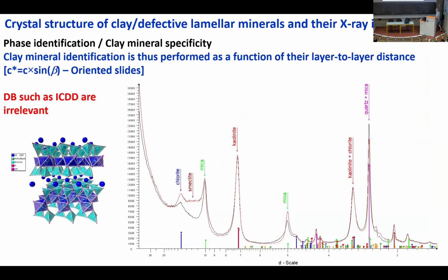We usually do that, so what we are interested in is to measure the thickness of the layers, which means to measure the thickness of these sheets here. And the easiest way is to have them settling like that on your substrate. In this case, you are able to measure directly the thickness of all these sheets.